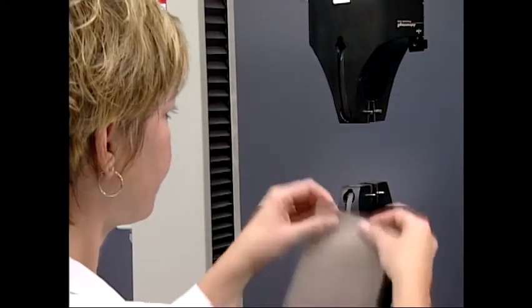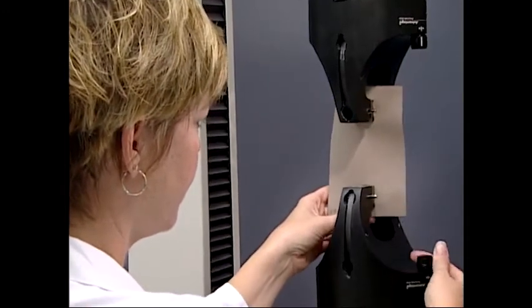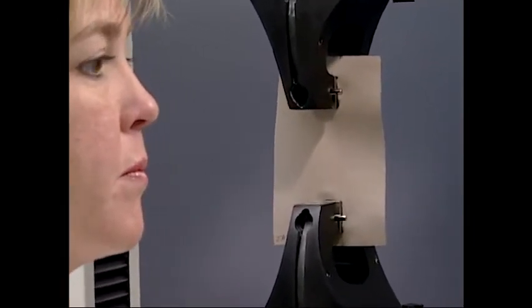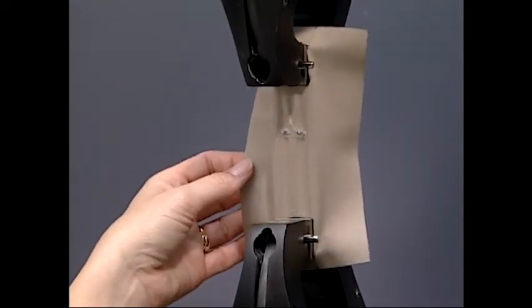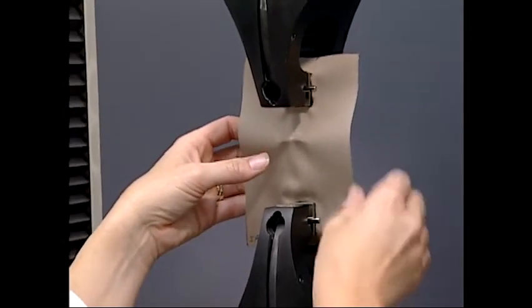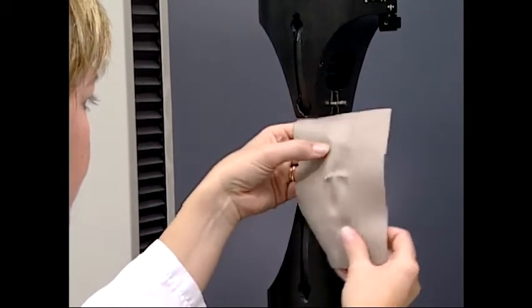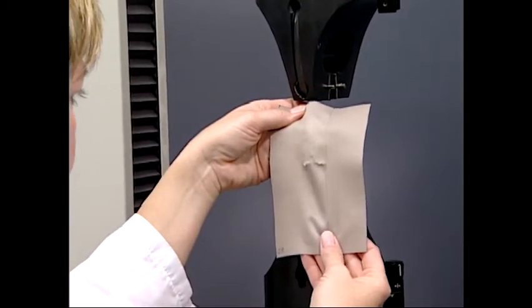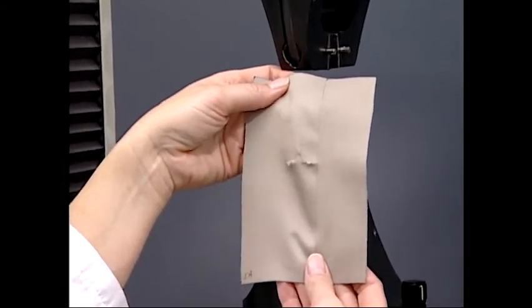Tensile strength is the force needed to rupture a material under tension. This relates directly to fiber performance, both individually and also in bundle form, such as in a spun yarn. The force measured to rupture a fabric is referred to as breaking strength or breaking force. The elongation of the fabric related to that breaking force is the breaking elongation. This is important as it describes the increase in specimen length at rupture over the original length and is expressed as a percentage. It's important to reiterate that these values are for force applied in only one fabric dimension, that is, length or width.